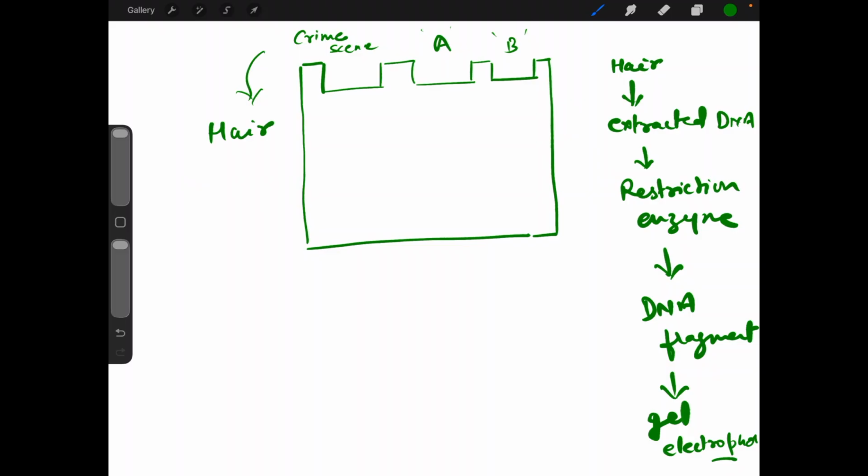So this DNA was recovered from the crime scene. So here is the pattern. And these samples taken from A and B were taken via buccal swab or cheek swabs, because VNTR patterns are inherited and highly unique to individuals. Matching the pattern is considered strong evidence of their presence at the scene.